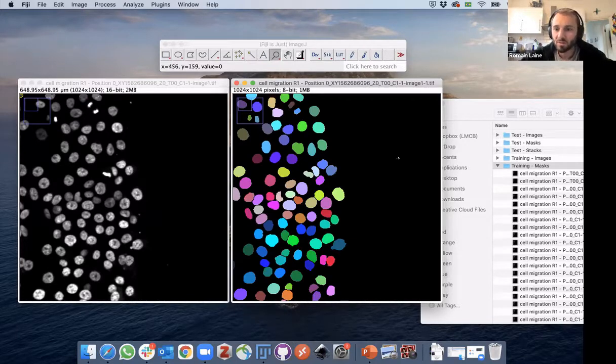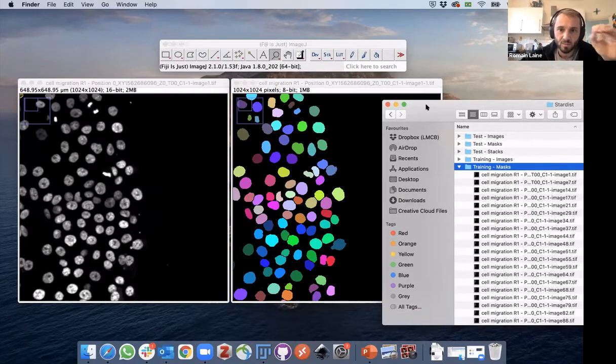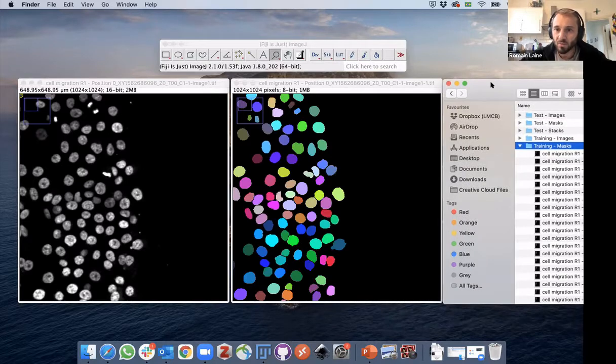Okay, but what's really important in what I'm showing you today is we already provide, and that's the starting point, a set of ground truth data. Okay, where we're starting from, the input, and the output, where we want to get to, what we call the target. That's really important because that ground truth is what the network will leverage to be able to learn how to improve its own parameters to perform the task that's at stake today.